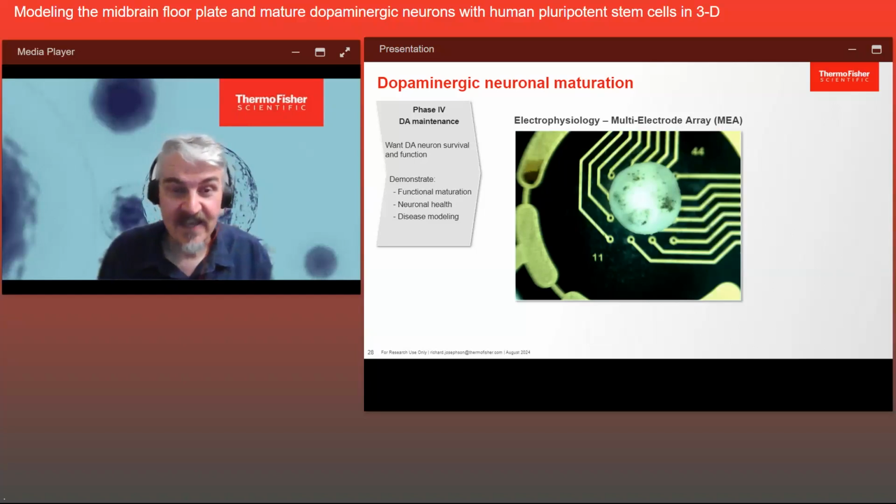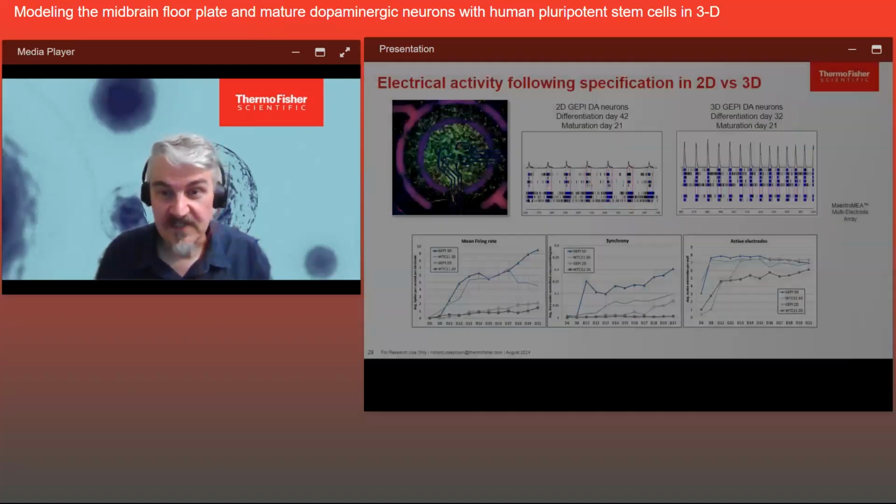You can attach whole organoids to an MEA, but it's difficult to do, and it typically takes at least 1 to 2 weeks before you can read the field potentials, during which you are very carefully fluid changing so as not to disturb that organoid sitting on the electrodes. So let me show you some data, first from dissociated neurons.